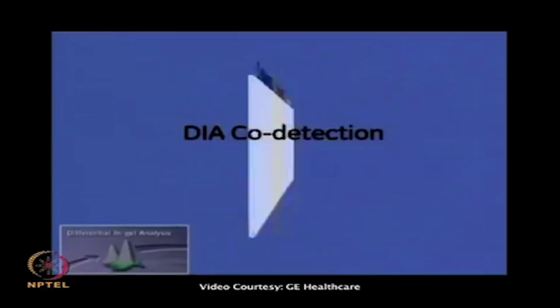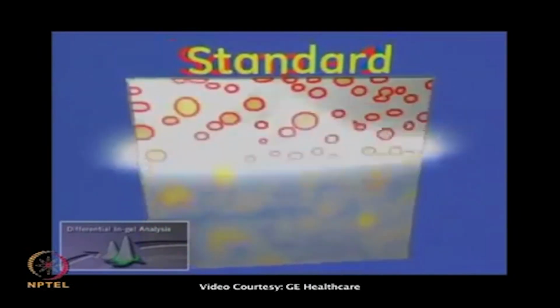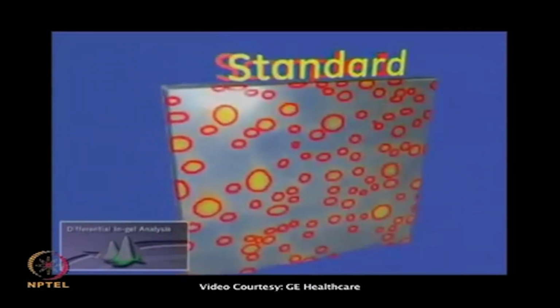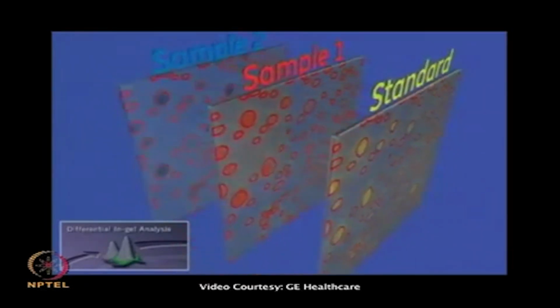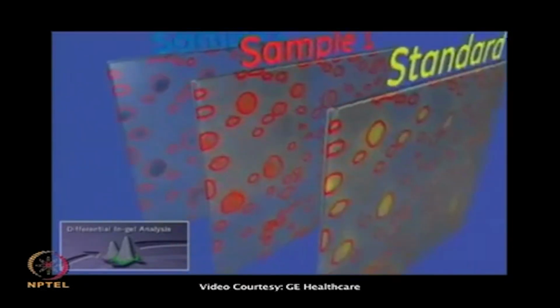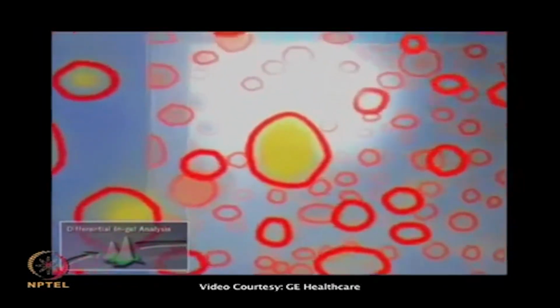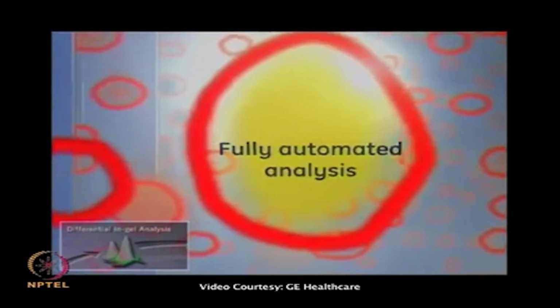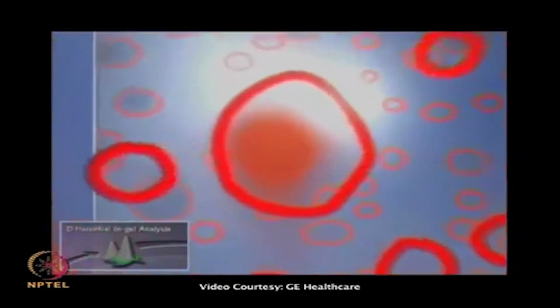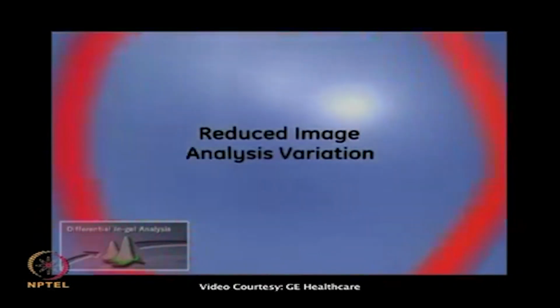Then in DIA there will be a co-detection. The co-detection is nothing but there is a standard gel which is labeled with Cy2. From the same area we are expanding the remaining two images also, so that artifacts can be minimized. Again, this is fully automated analysis. There will be very little manual interference in this analysis.